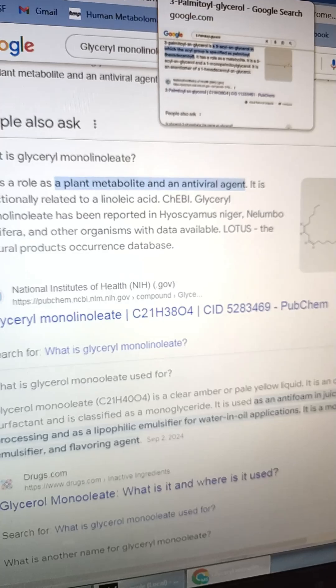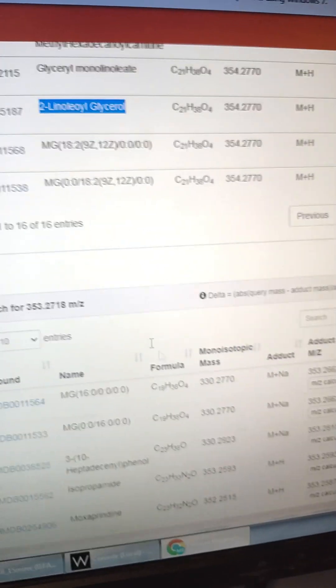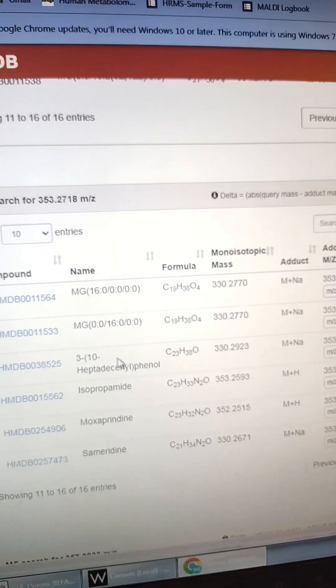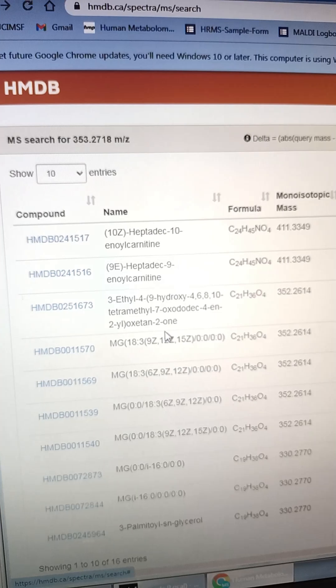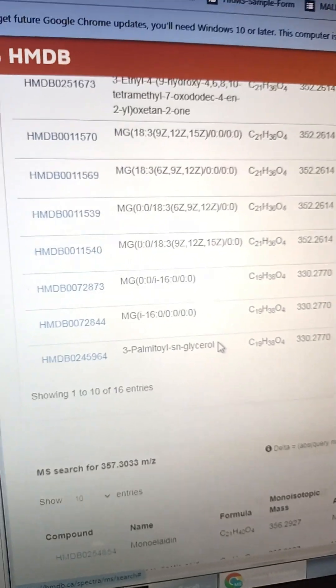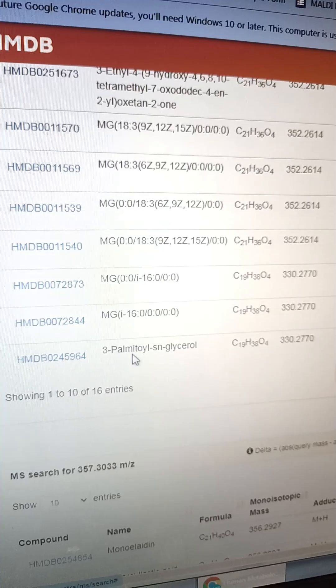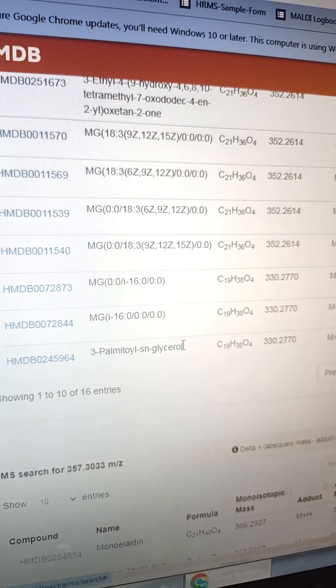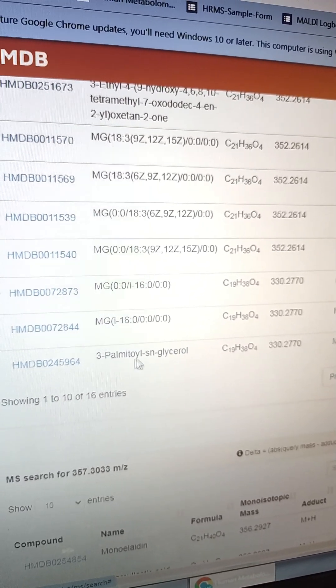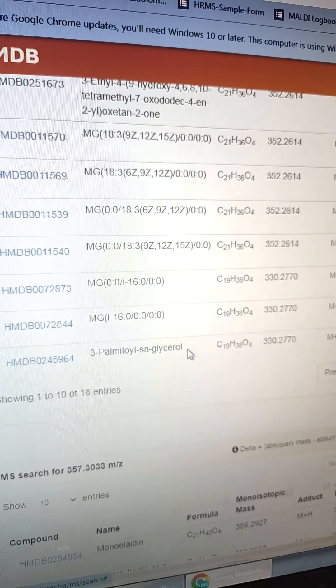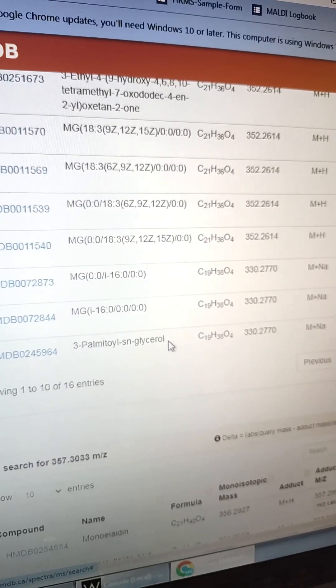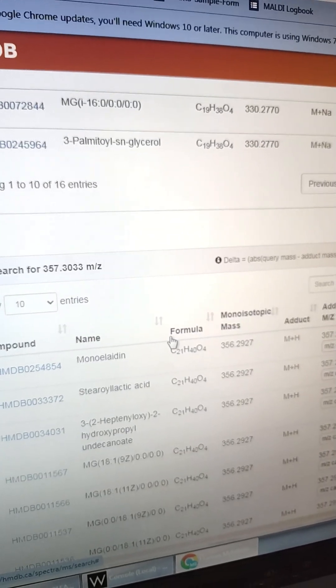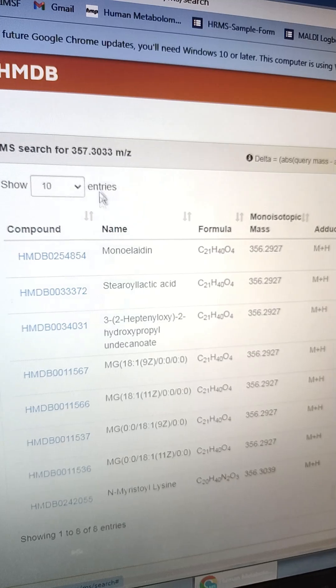This is only in the canola oil. So now 353. This makes the most sense. Same kind of situation, but this is the palmitic acid. And we did see palmitic acid and oleic acid in the GC data, so that makes sense. And this is the glycerol conjugate of that. Probably some sort of flow additive or from processing.